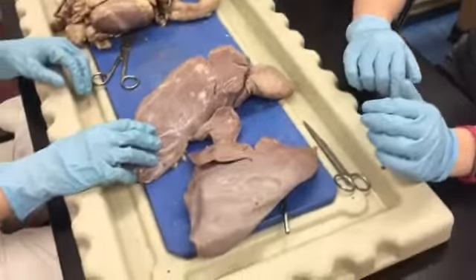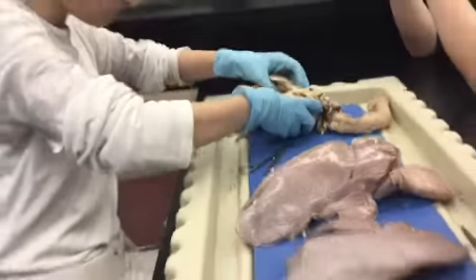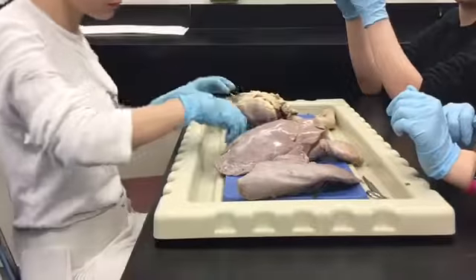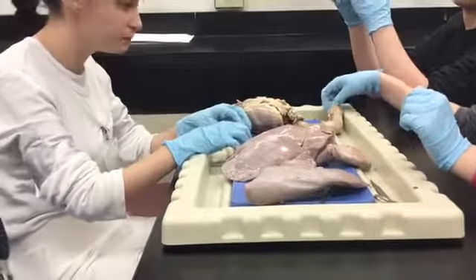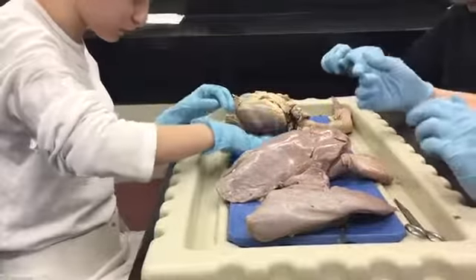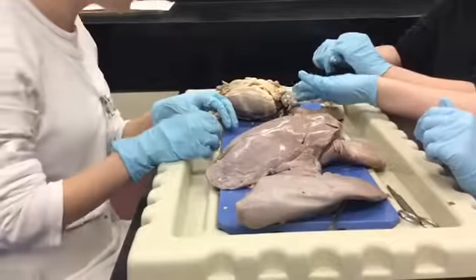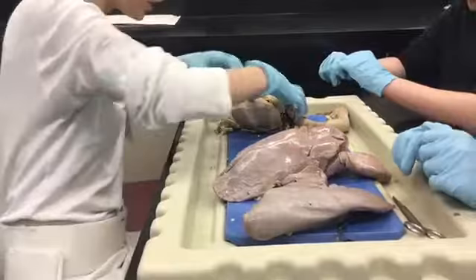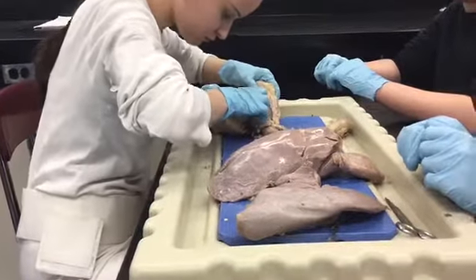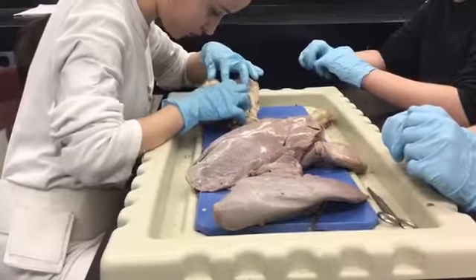We'll just go with whichever has more lobes on the test. This sheep just, or lamb, or whatever it was. Sheep. Yeah. This sheep had super lungs. You guys are fun to work with. Vein or artery or something. There's one right there, I think.